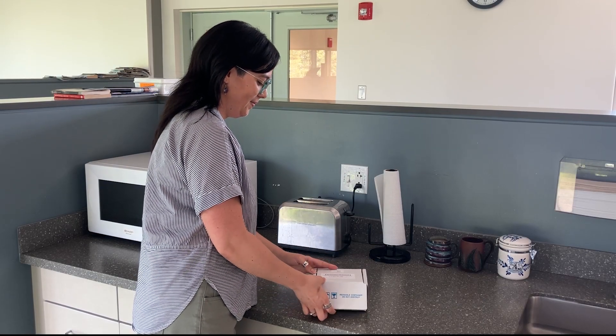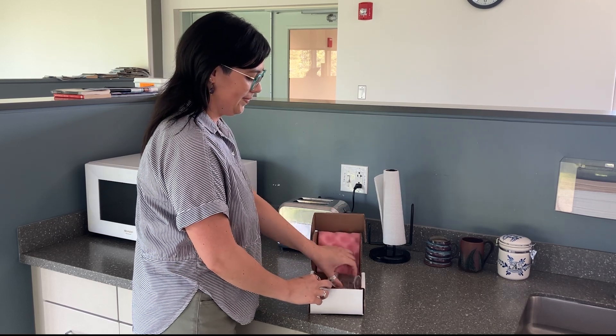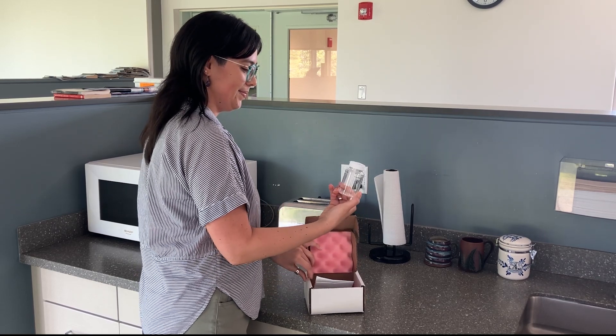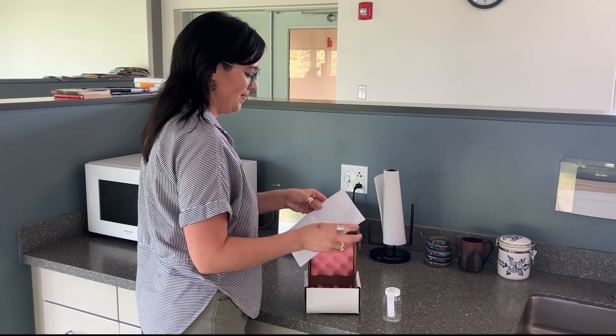This is what your kit will look like when you get it in the mail. It has a 100 milliliter plastic bottle with a powder preservative in it and a water sample collection form. You will need to fill out this form completely before returning your sample.